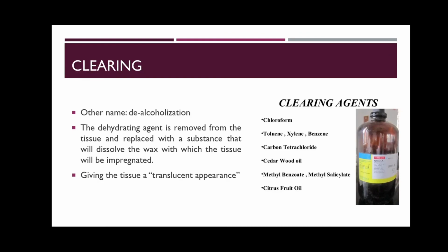Step is clearing, or what we call de-alcoholization. De-alcoholization meaning to remove alcohol. And where did you get the alcohol? From the dehydration step. So this is the process whereby alcohol or a dehydrating agent is removed from the tissue and replaced with a substance that will dissolve the wax later on, with which the tissue is to be impregnated.